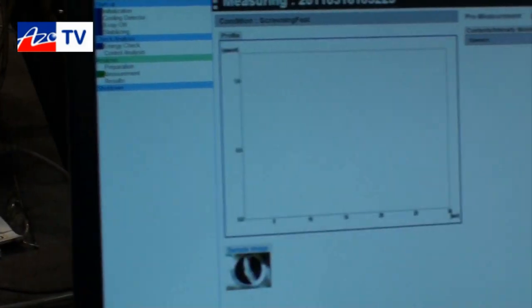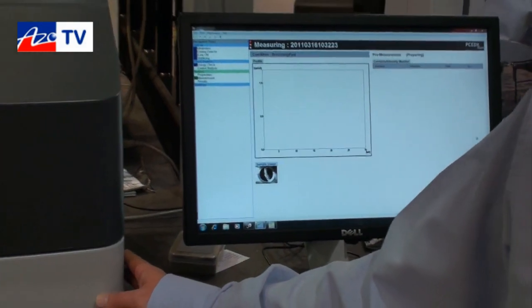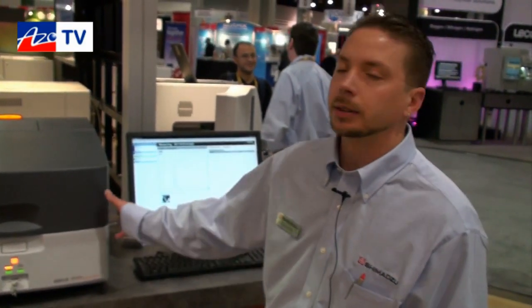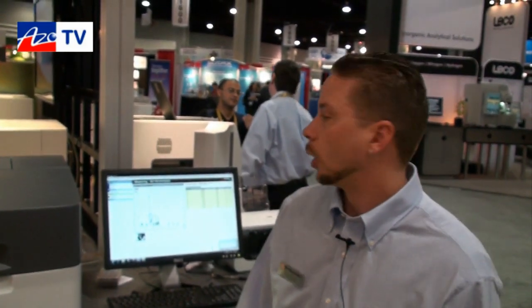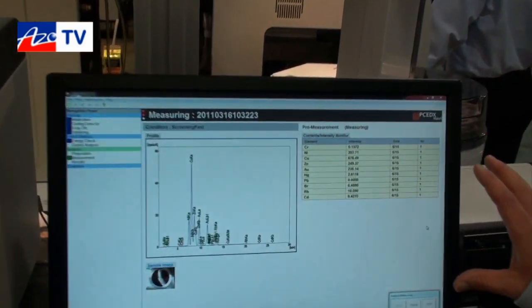This system utilizes a liquid nitrogen-free detector — it's a silicon pin diode. We use a rhodium X-ray source, and it's designed for surface to slight penetration analysis and for the application of RoHS, or Restriction of Hazardous Substances.